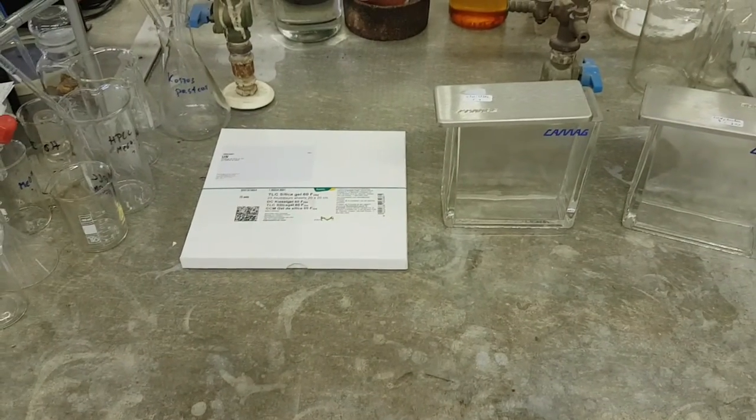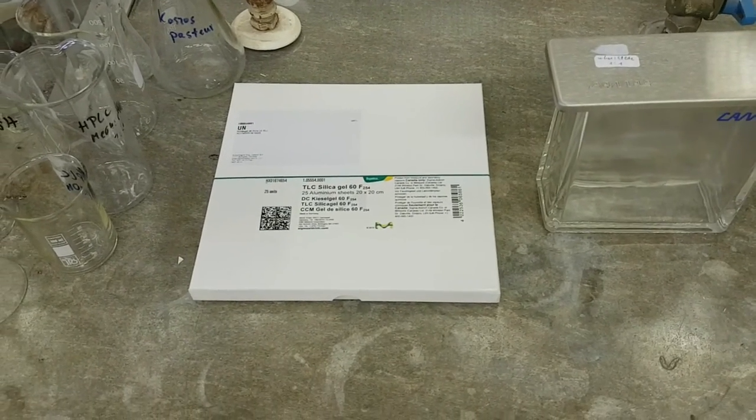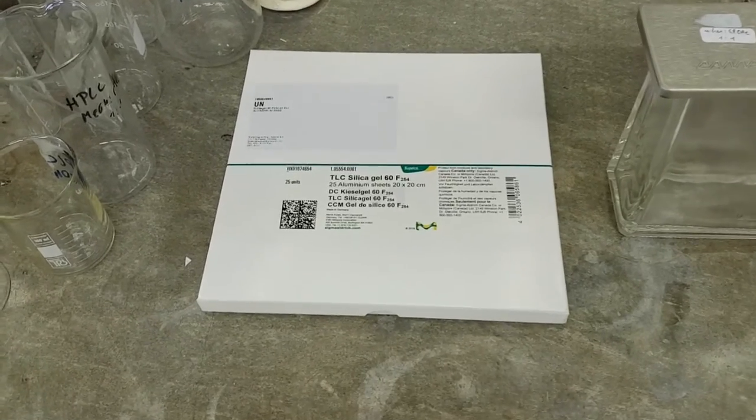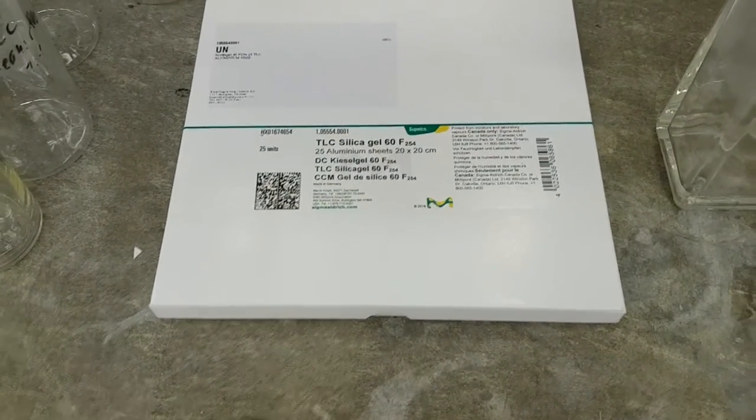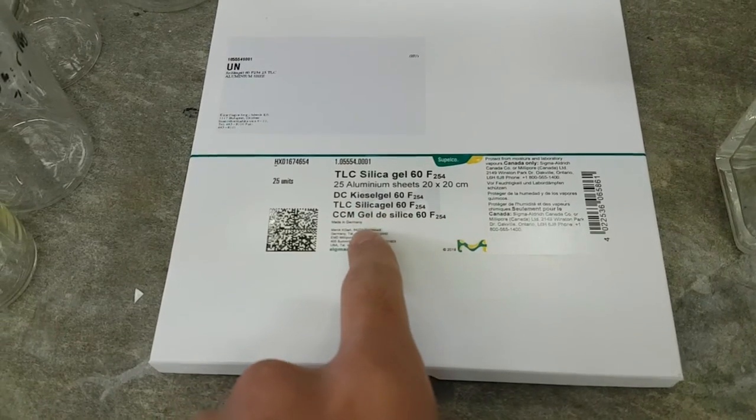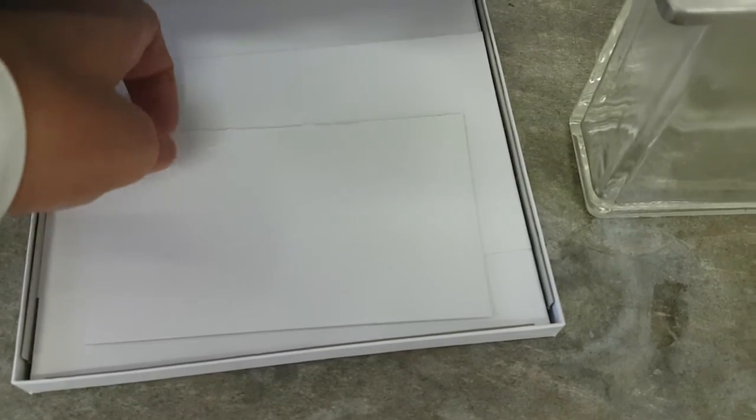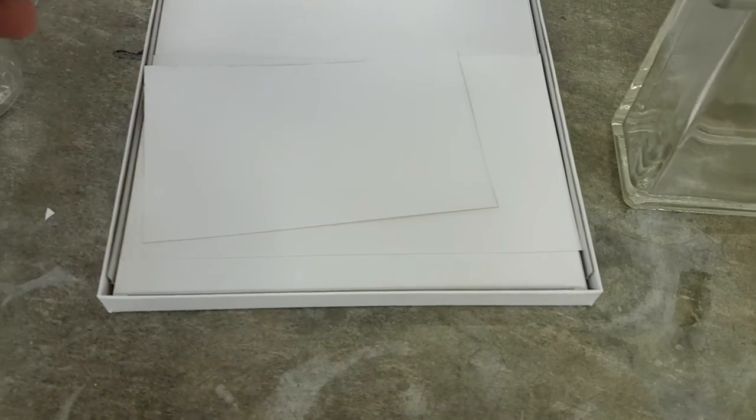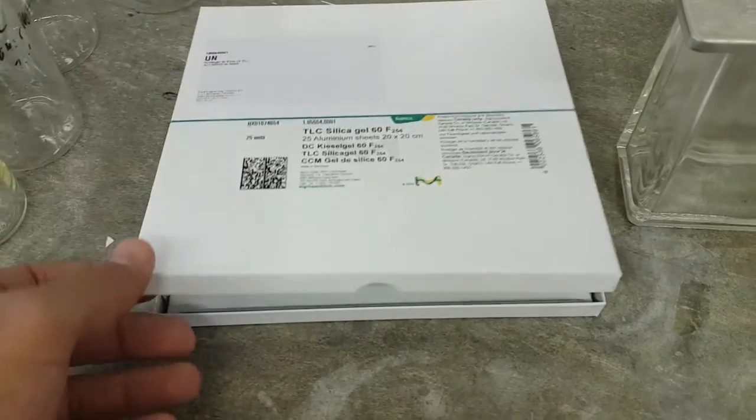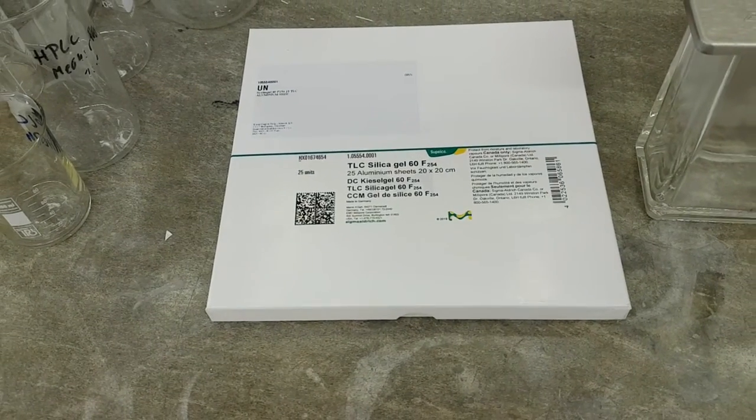Thin layer chromatography is considered an analytical method to make separations. First, we need a TLC plate, which you can get commercially. This plate is coated by silica gel 60F, or you can prepare it well, but it's better to obtain it commercially because it is well prepared and carefully made.